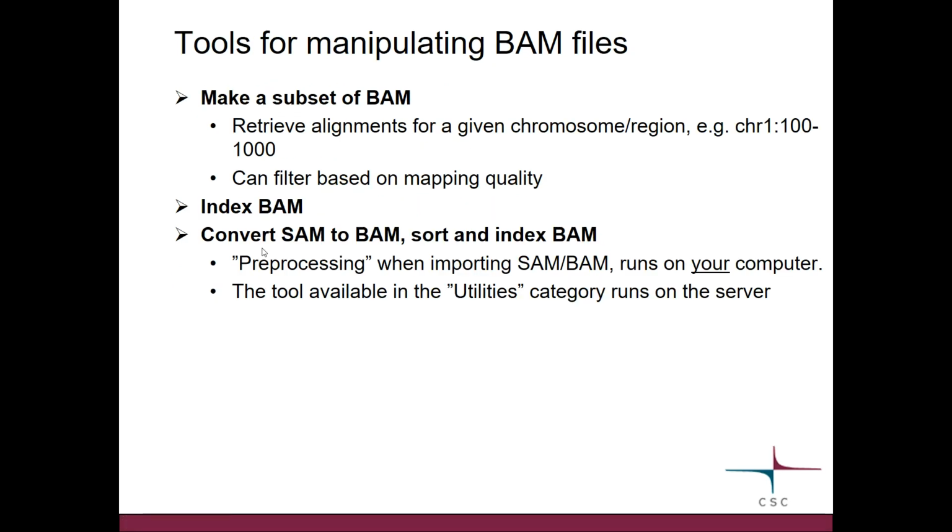There are also tools for manipulating BAM files. So you can make a subset of BAM for your favorite chromosome or region. And this subsetting can also use mapping quality. So you can take only the good quality mappings to that region.